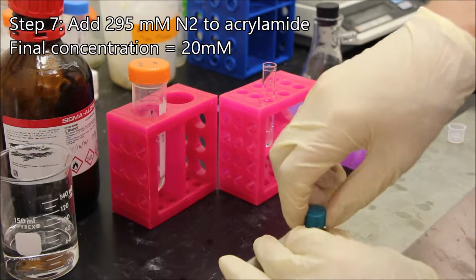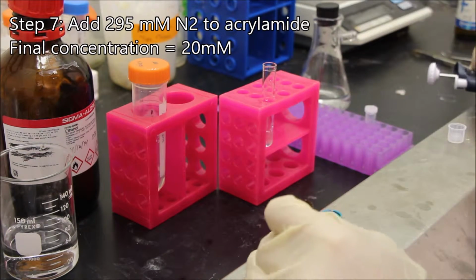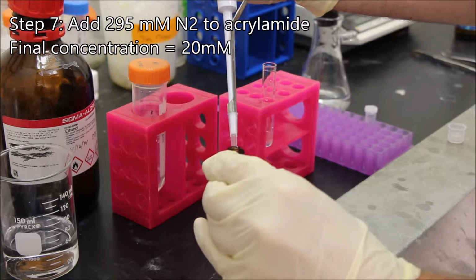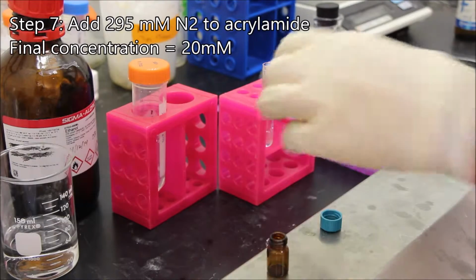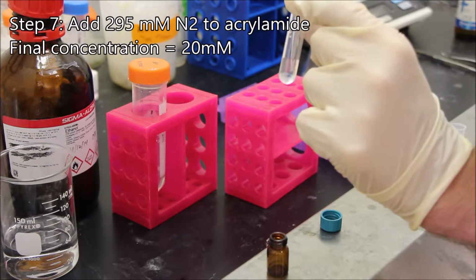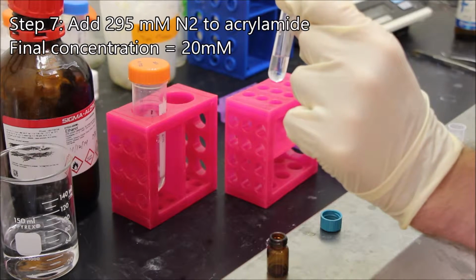Now I'm going to place 70 microliters of this solution in here. Pipette up and down a few times to mix.